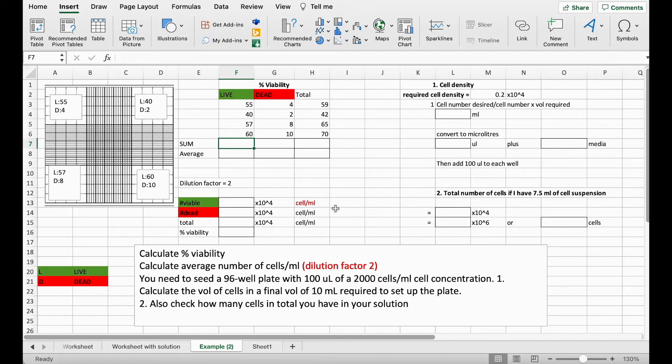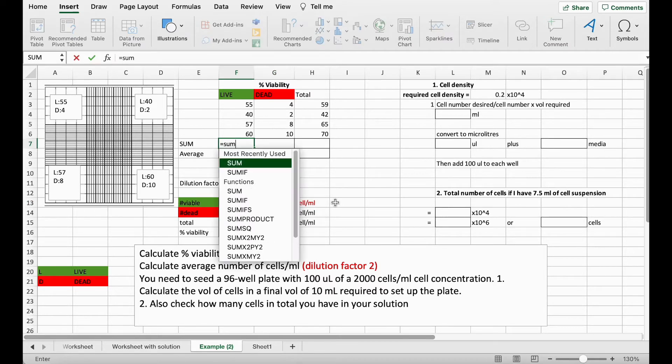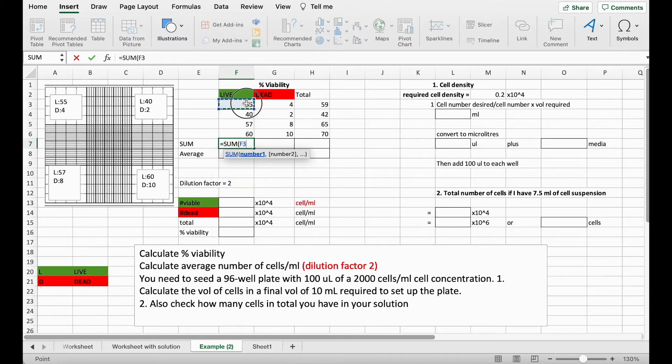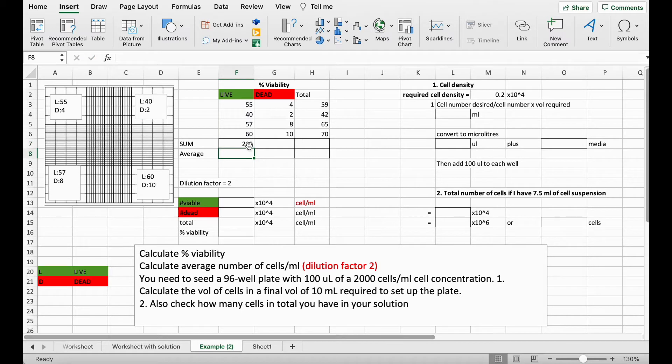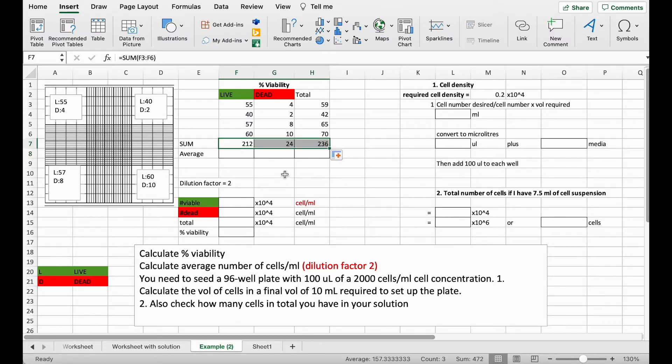So the first thing to do is to get the sum of all of the cells counted. We can do that using Excel and this formula and that gives us 212 and we can do the same thing for the dead and the total columns just by dragging it along.